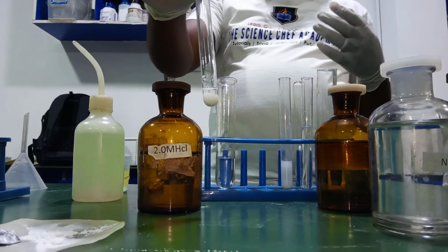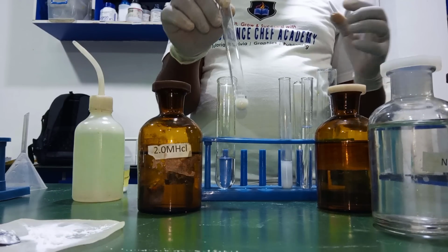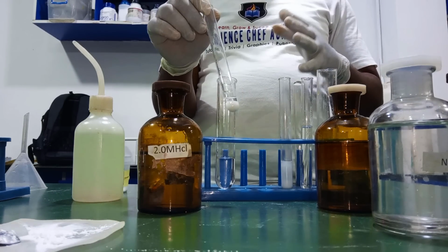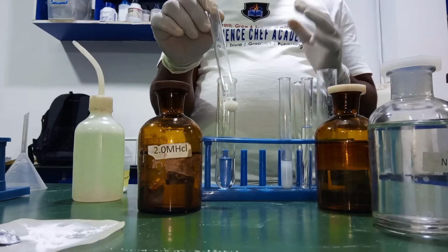Pb2+ ions, right? So at this point, after warming and allowing to cool, you can state that the precipitate dissolves on warming and reappears on cooling. Then Pb2+ confirmed. The precipitate is lead(II) chloride.